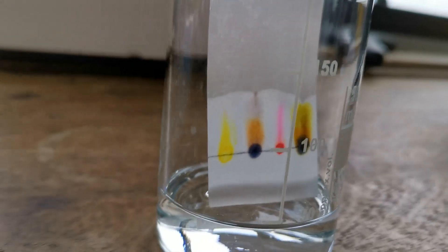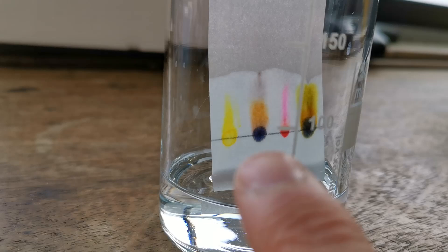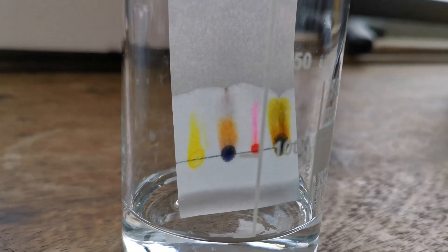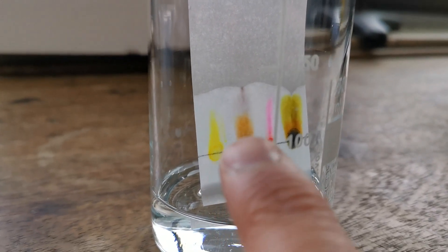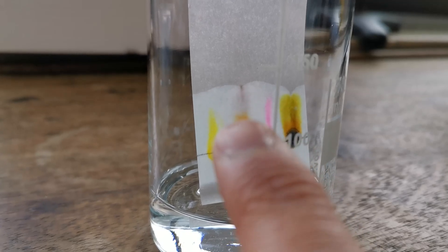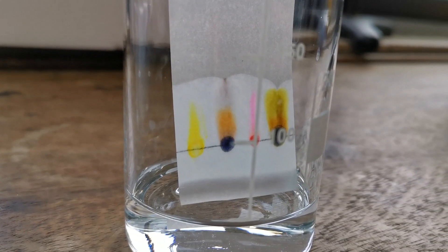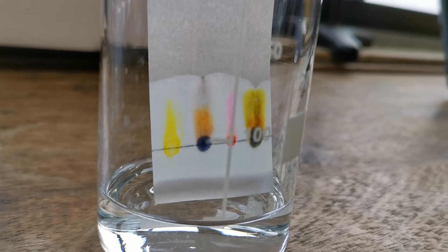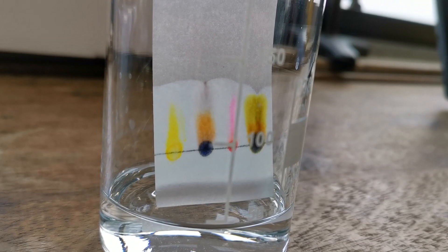You can start to see that some of the dots are separating. For example, if you look at the second one — the dot of the black ink, which is B — you can start to see it's separating into two colored dyes. We'll leave that to separate for a bit longer and then come back to it.